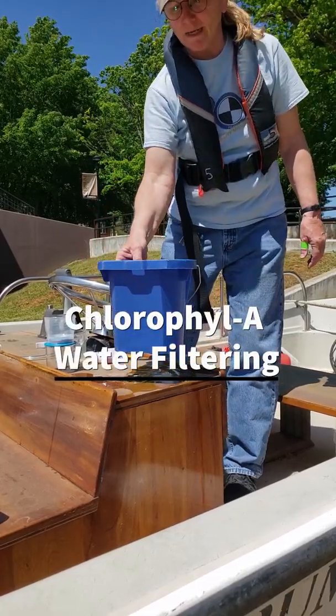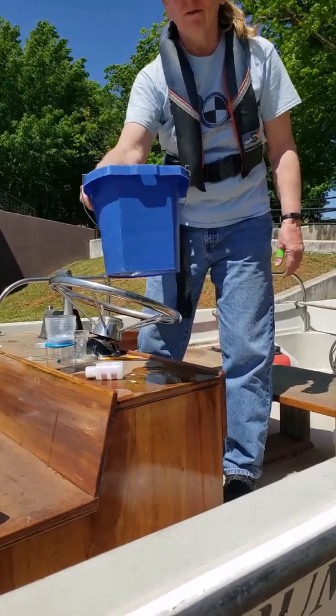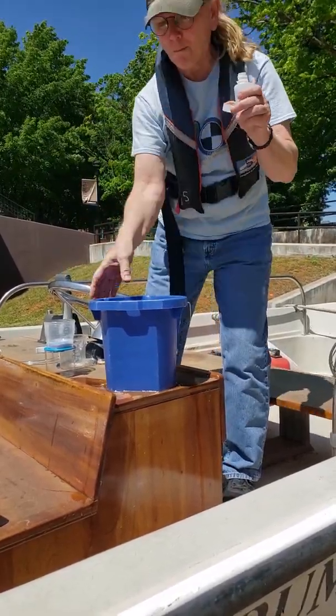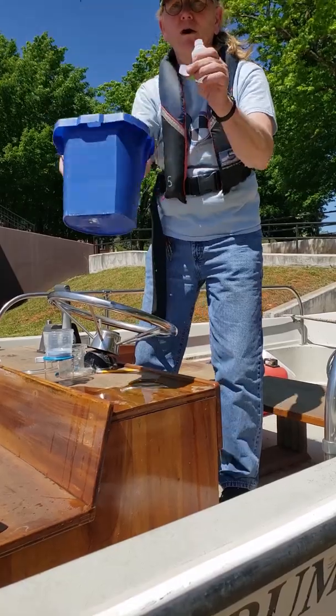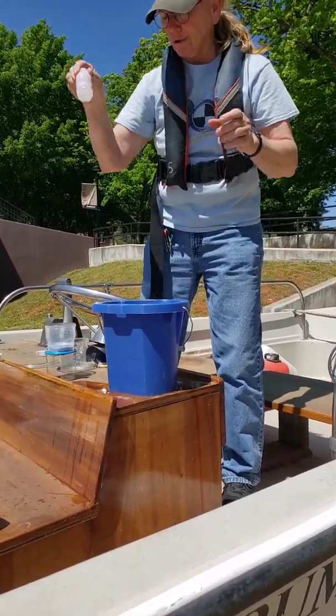Once you've got your water sample in your bucket, you want to swirl the bucket to mix the sample. Then you want to pour from the bucket into your sample bottle. You need only fill it to the shoulder of the bottle. That will go in your cooler.